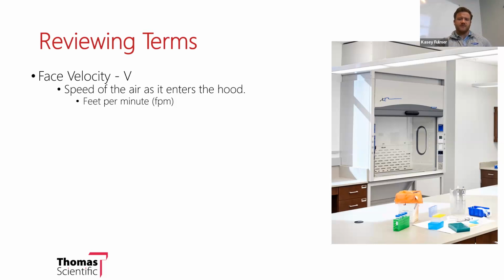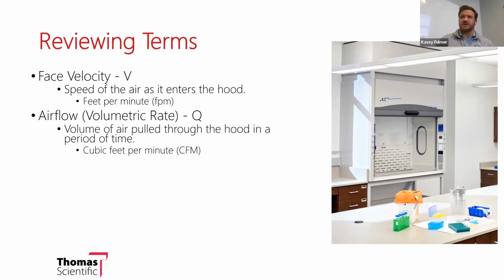And then airflow is a common terminology for the next definition, but it's better related to a term of volumetric rate. So it's actually the volumetric rate of the air that's exhausted through the hood at any time.